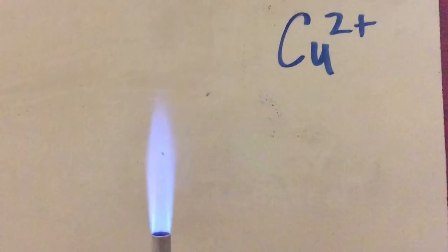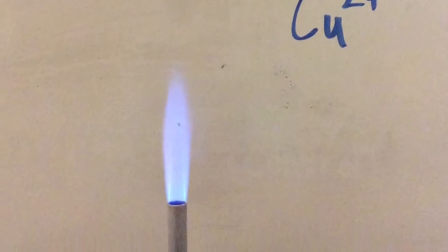All right, here's the 5th one, lithium ion. It's a +1. Ooh, hopefully you can see how it's almost a magenta, fuchsia red that comes out with lithium. It's really, really pretty. All right, here's burn number 6, which is copper. So hopefully it's coming through that it's a real pretty green color, for St. Patrick's Day, I guess, or it's just copper and it's green.